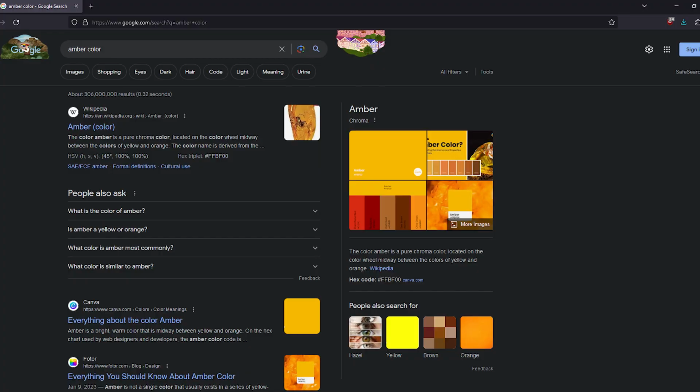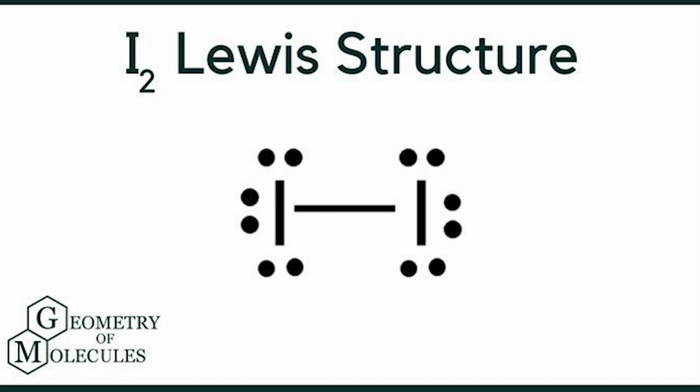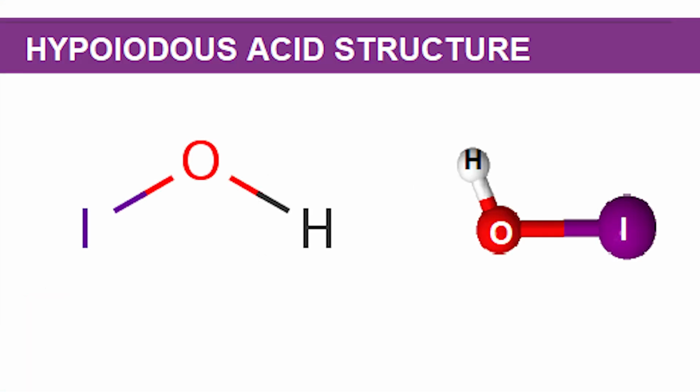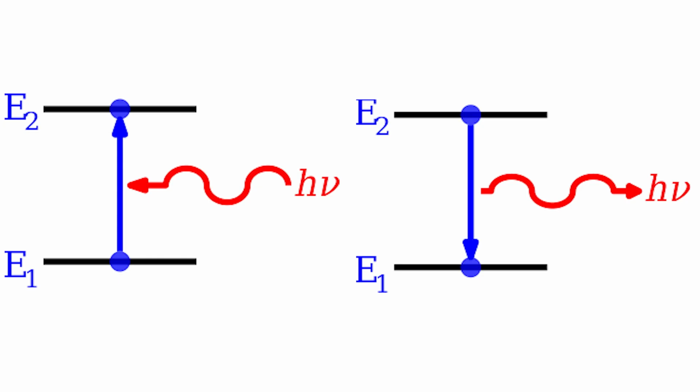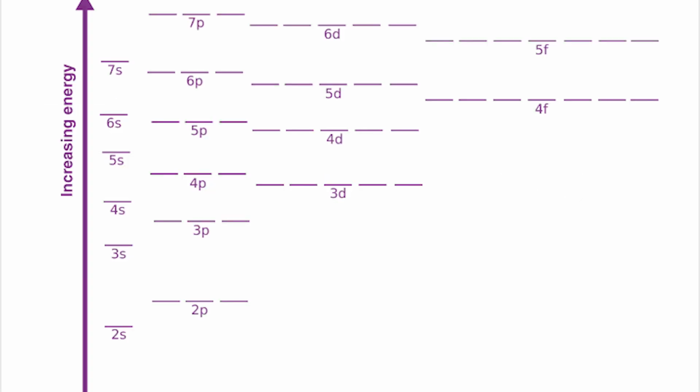The resultant amber color is from the iodine in the solution. When dissolved in weakly polar solvents, the iodine turns brown. While the exact cause for the color is not known, it is suspected to be the energy absorbed and released by the iodine molecule in its partially ionized state. When photons hit iodine, they raise the energy level of its electrons, which then lower, releasing a brownish yellow light.